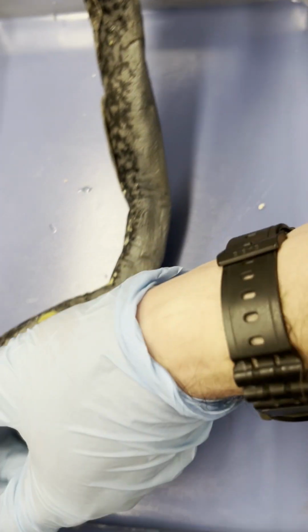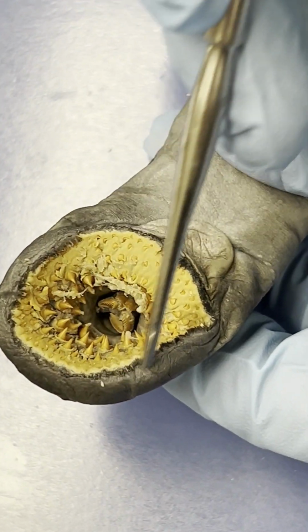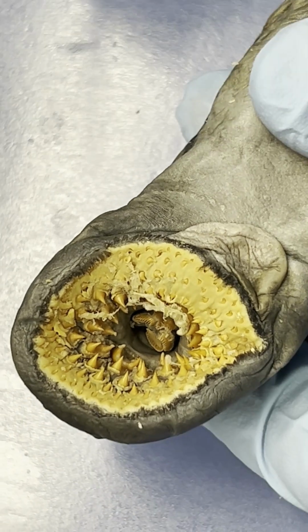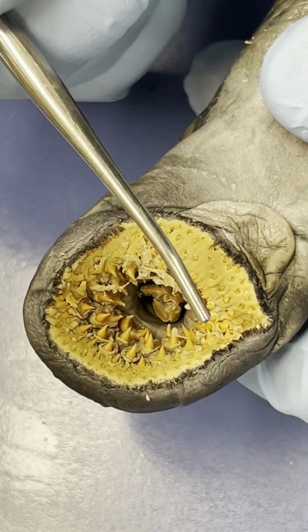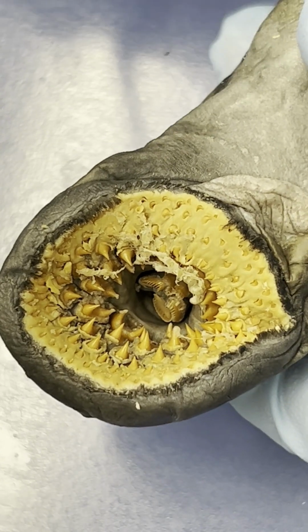But lastly, technically, it's going to be an internal structure. We're actually looking at its buccal funnel or buccal cavity. So there's three structures that I want you guys to know. Again, technically, these are internal structures. But around this buccal funnel, keep in mind, that whole thing is the buccal funnel where the fish latches onto a rock or host fish.